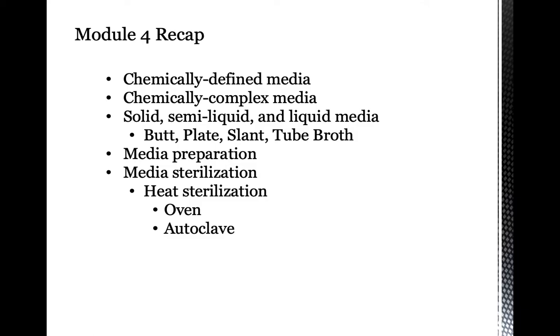So before we begin with our pre-lab, let's have a quick recap of what we have learned so far. Last week, we were able to carry out our third activity, which is on culture media preparation. During the pre-lab, I talked about the different types of culture media based on components and based on form. Based on components, we have chemically defined media in which the component ingredients are all defined compounds.